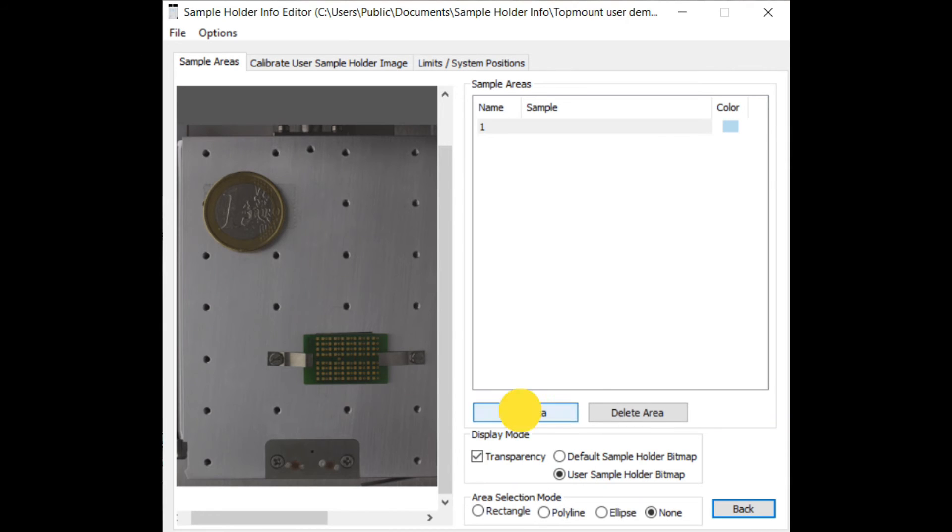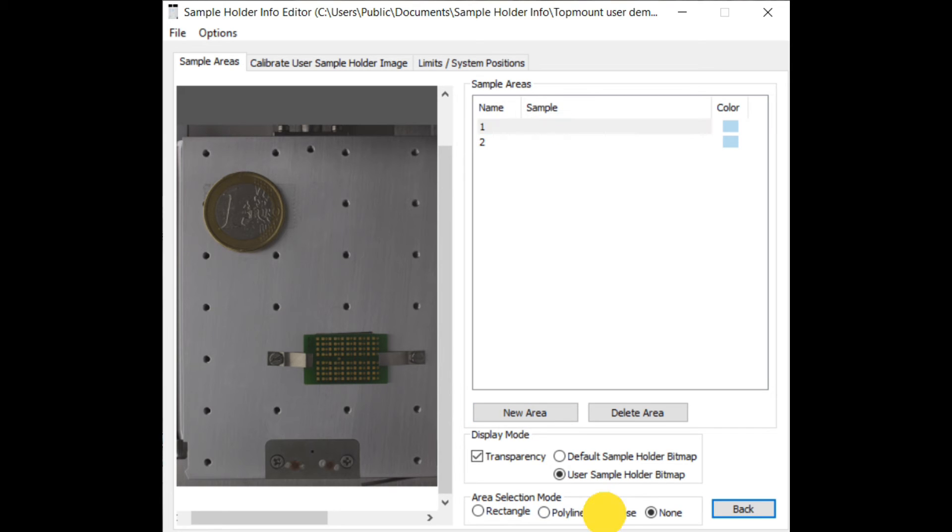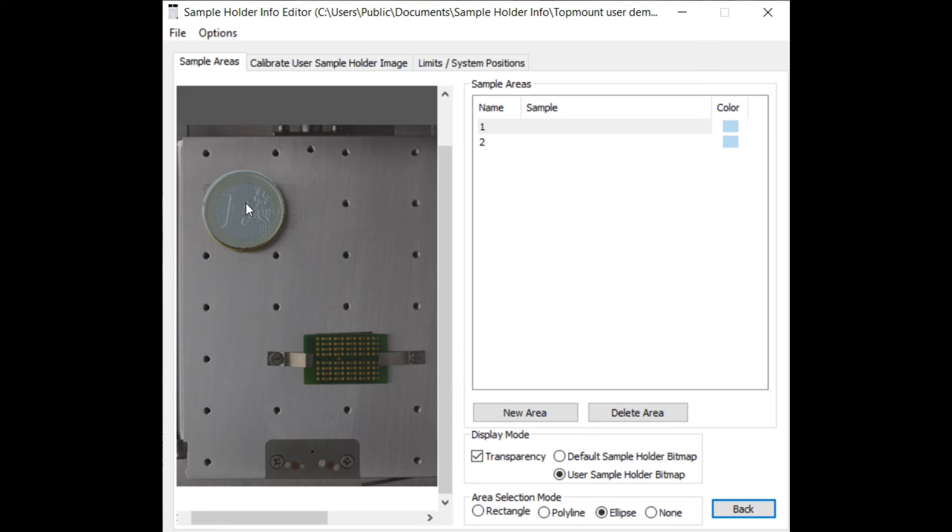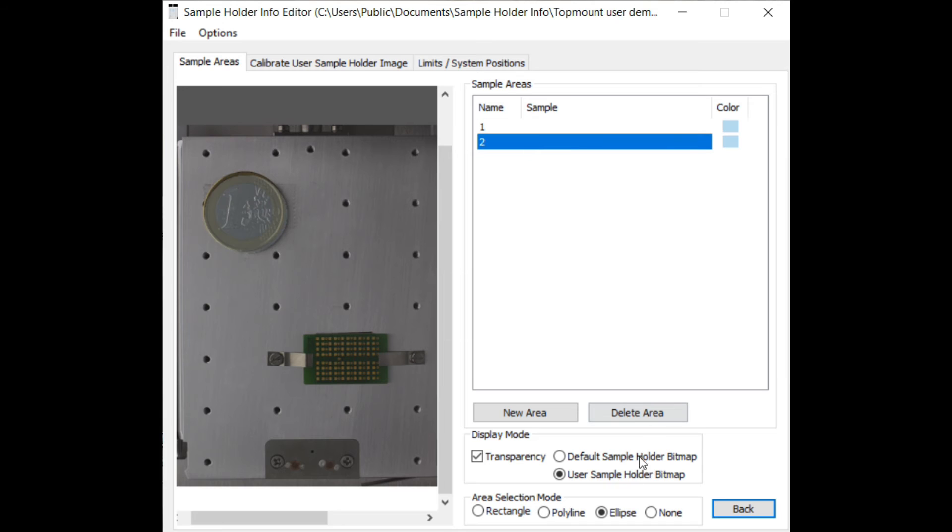Add new areas to the list and activate the area you like to specify. Then draw a sample area. If you use the polyline tool a right mouse click at the end will close the area. You can select an area and move it around to correct mistakes.